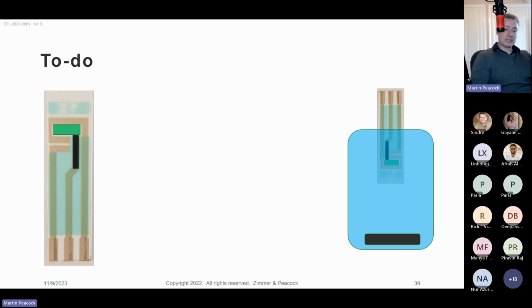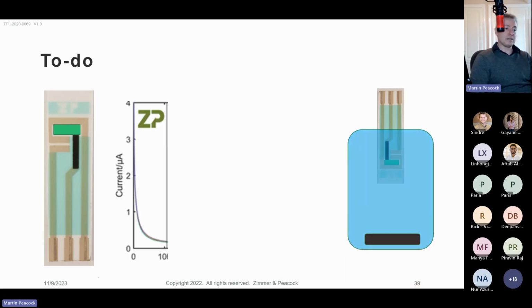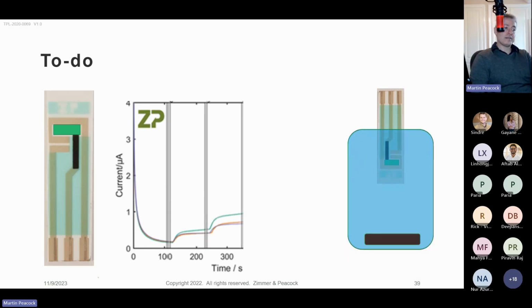So somebody's got an instruction, they go into the lab, they put the sensor into a test cell, they start the experiment, they then add some glucose and the signal goes up. And you'll notice that what they're doing is they're being told by the SOP: wait for a certain amount of time, add glucose, wait for a certain amount of time, add glucose, wait for a certain amount of time, add glucose.